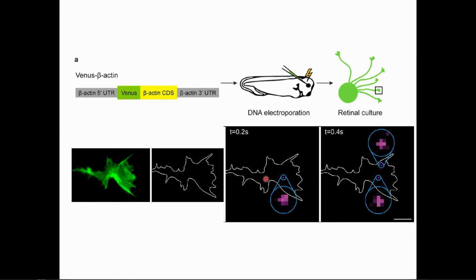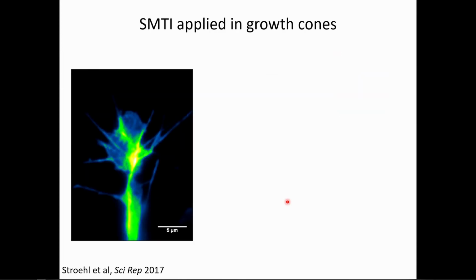The fusion construct is turned into protein by the ribosomes in the translation machinery, and then we get a flash of light when the polymer comes off the ribosomes and folds into the correct configuration. And it becomes a fluorophore, of course, because the GFP is attached to it. We get a flash of light. We can localize that flash of light and use this fitting technique to actually precisely target where that event has taken place. And we can then correlate this to functional information, and in living cells.